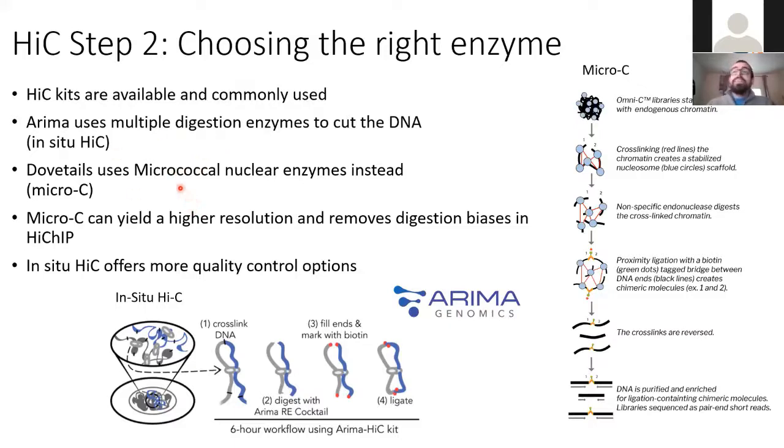However, since in this one you know where you are cutting, you also know where your reads should be, so you can filter your reads more easily with an in situ Hi-C. So if you don't want a resolution that's incredibly high and that requires billions of reads, you're better off with the ARIMA kit and in situ Hi-C.